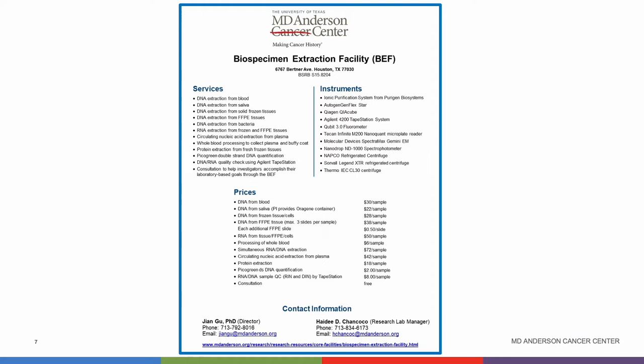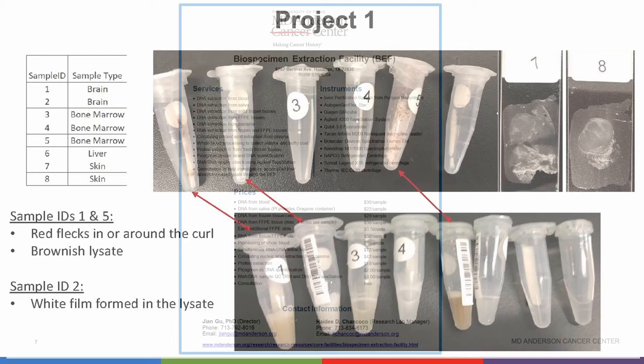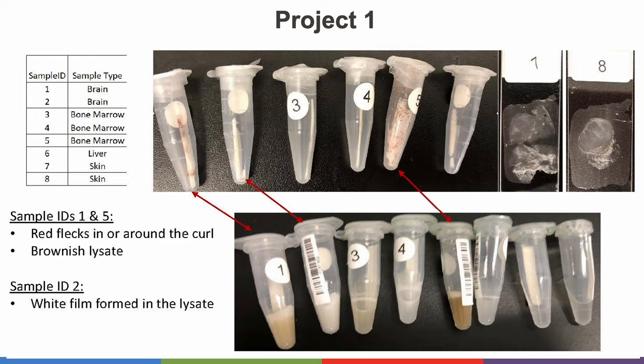Now I go back to a few small and large projects to demonstrate the power of these techniques. I will not disclose the purpose of the study or the PI's name, because this is purely from an R&D and technical point of view, focusing on quality and downstream application quality. This is the very first project we worked on with Purigen. One of our faculty generously gave us a few samples from various sources: brain, bone marrow, liver, and skin. We had already done column-based extraction before and had some difficulties, with some yields very low. So we said maybe we can try these Purigen techniques.